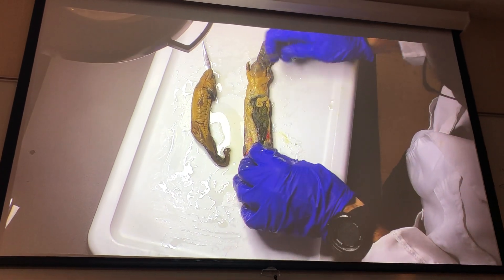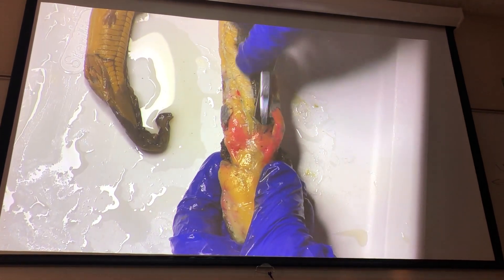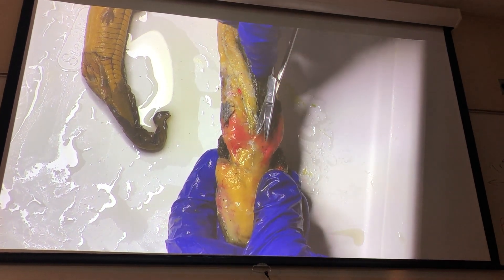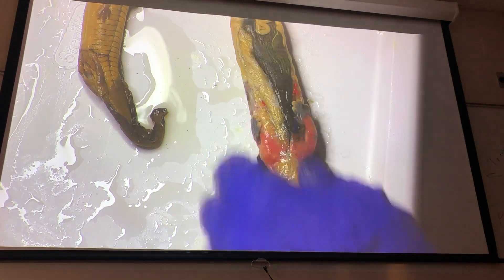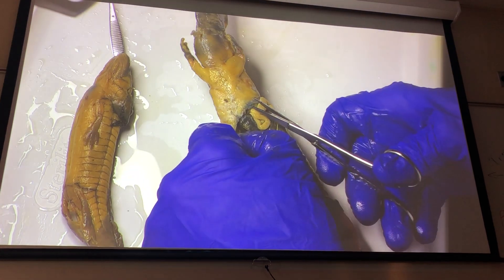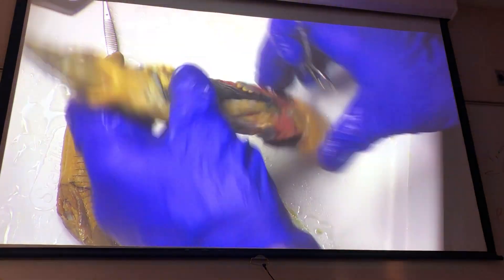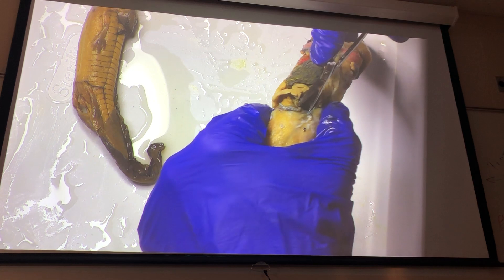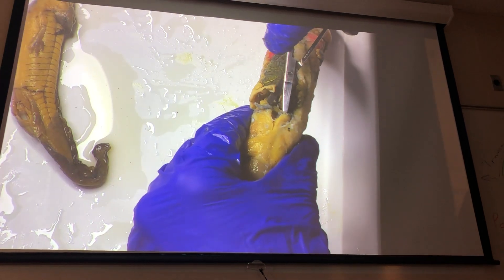We've got an opening already, so we're just going to continue on. Make sure that tine is pulling up on the above lining structure so you're less likely to cut into the underlying structures. Come up right to about here, to about the supercoracoideus. Going down can be a problem because everything's pretty tight in here and you can damage the intestines. So it's a good idea to kind of bend the hips when you go so you can see where you're going and give you a little more flexibility — and the mud puppy a little flexibility too.